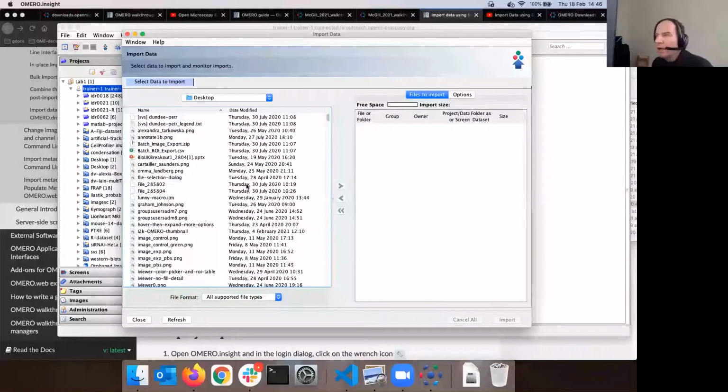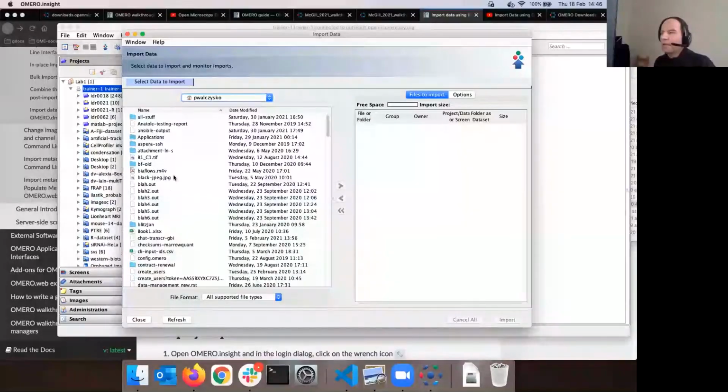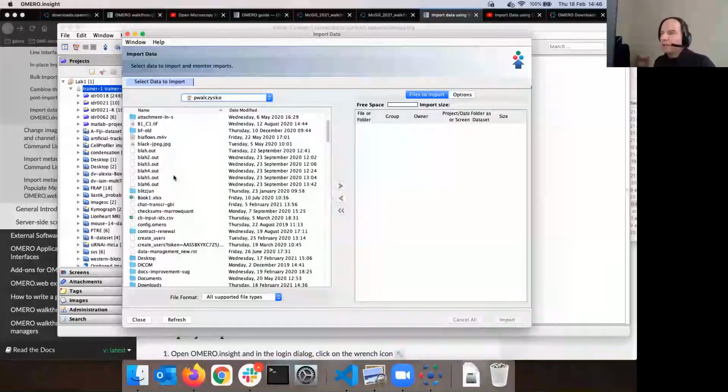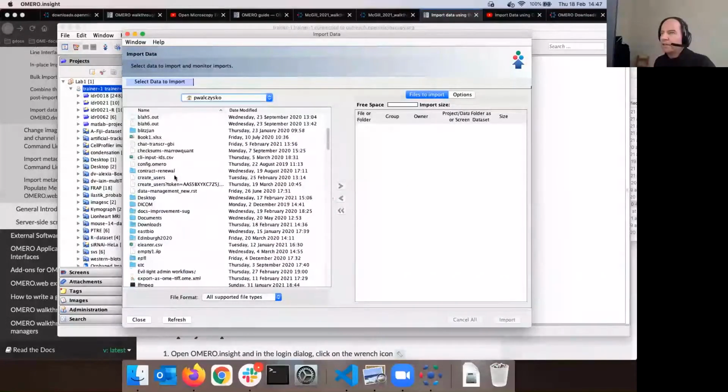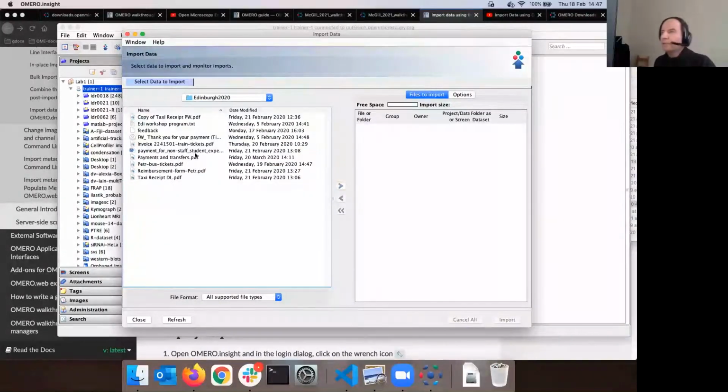Now, I will just navigate to here. And then I can go and say, Edinburgh 2020. That's a bad idea.